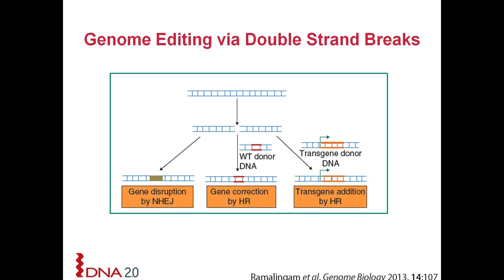Is using gRNA more efficient in activity compared to using crRNA and tracrRNA? Sorry, tracrRNA. Yeah, tracer. That's a good question. I have only worked with the chimeric single guide RNA because it just intuitively seems like it will be more efficient to me. I have not tried the two RNA system per se, but just intuitively it seems like less components should be better, higher efficiency, less moving parts.